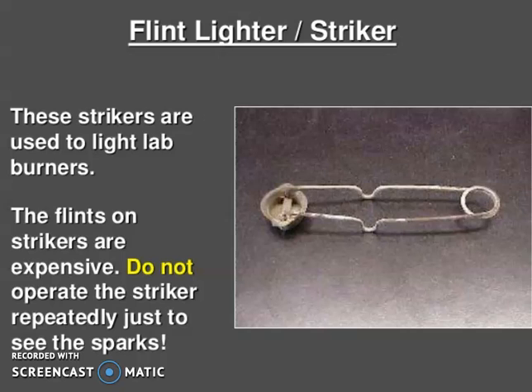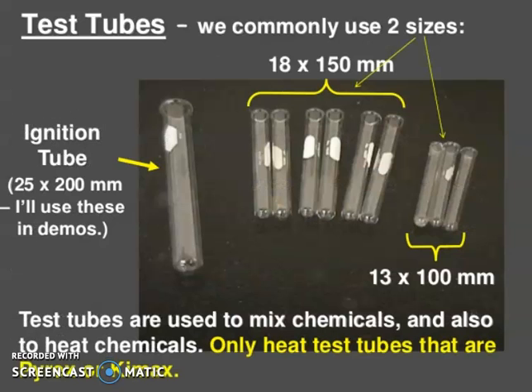Now, flint lighter or striker. These strikers are used to light the lab burner. The flint on the strikers is expensive. Do not operate the striker repeatedly just to see the spark.